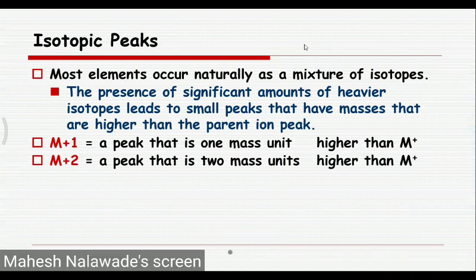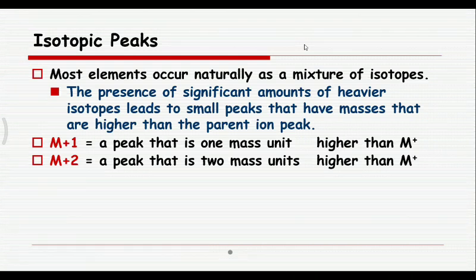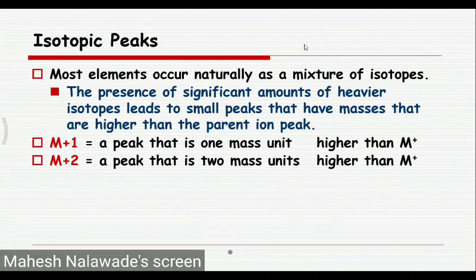Let me quickly start. Isotopic peaks in the mass spectra. Isotopes. Can anybody give me the definition of what are isotopes or examples of isotopes?